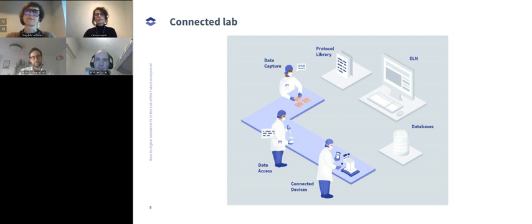And they go hand in hand with things like smart glasses as well, which will help augment what you're looking at in the laboratory, as well as giving you audio stimulation and audio information about that.